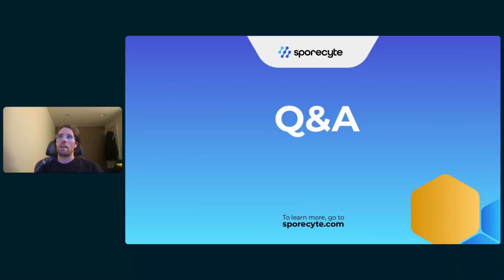So like I said, there's about 5 minutes here for questions. If anyone has additional questions, it felt like we blew right through this information. If you haven't used the app yet, you can get started and play around in the app. You can see it's pretty straightforward. It's essentially taking the forms from the chain of custody field and digitizing them so you can fill them out on your mobile device.